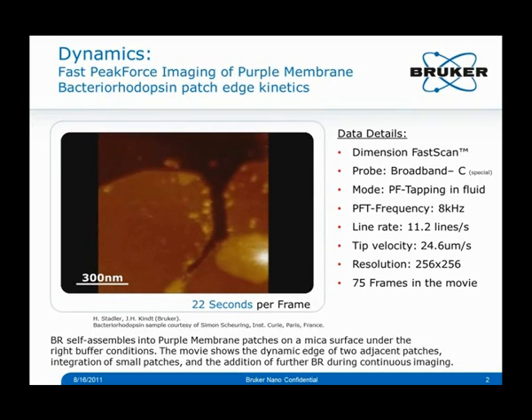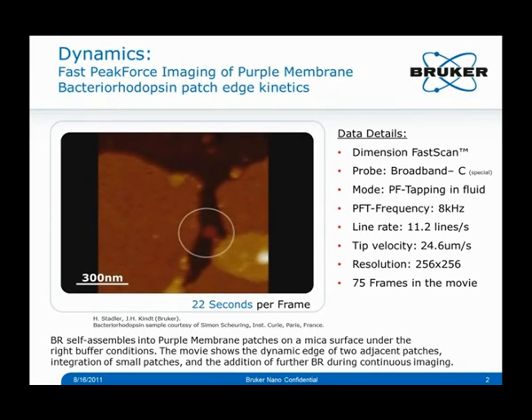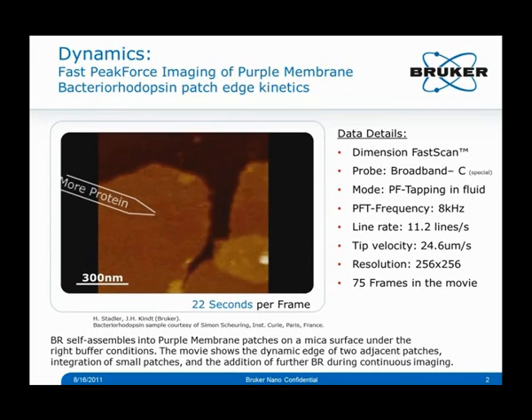So there is a little piece of the overlapping patch on the right hanging into this gap, and over the first few frames, right in the circle now, it's separating from the right overlaying patch, leaving this sort of extension there in the gap. And now this patch is being integrated into the left large patch. So let's see this again. Here it's still attached, and here it's already integrated into the left patch.